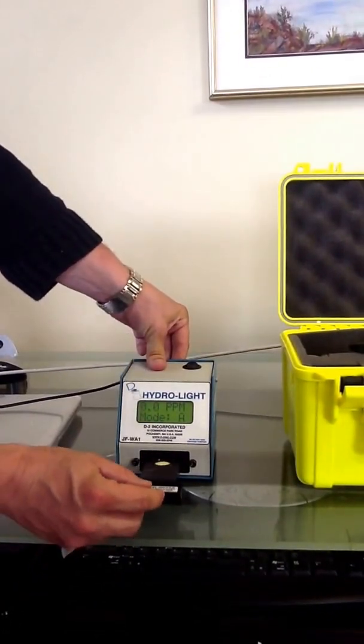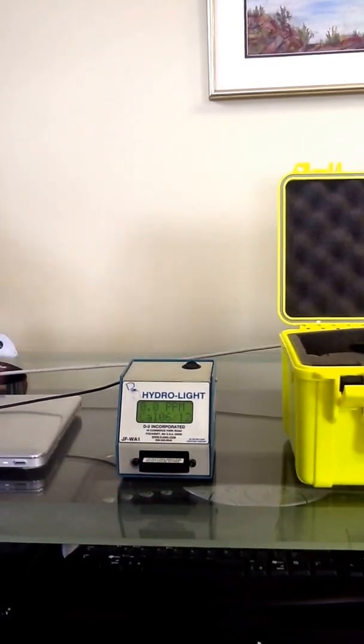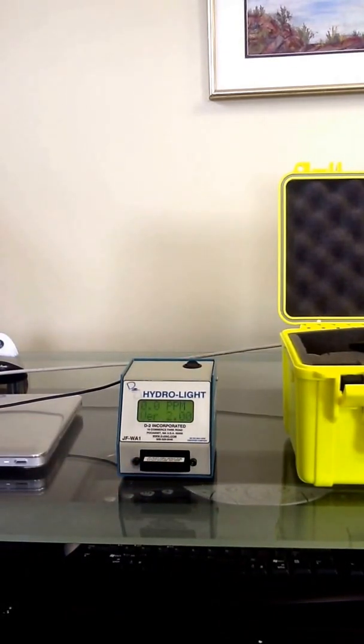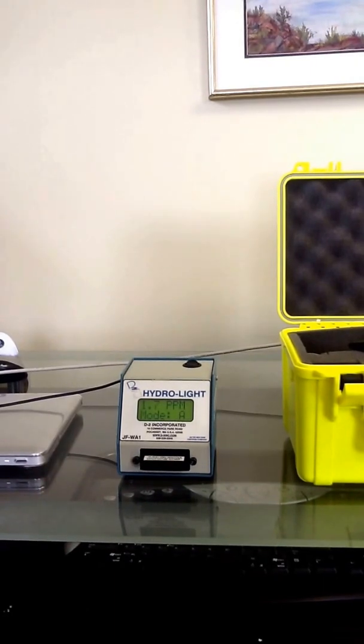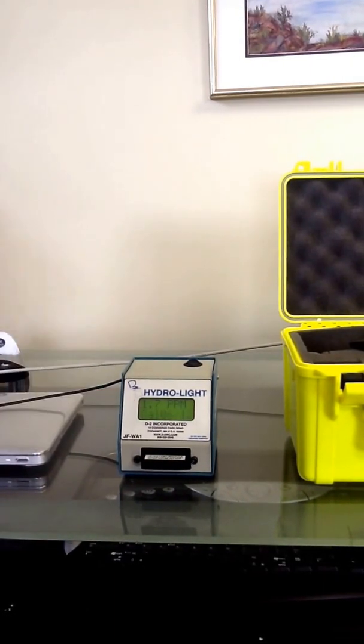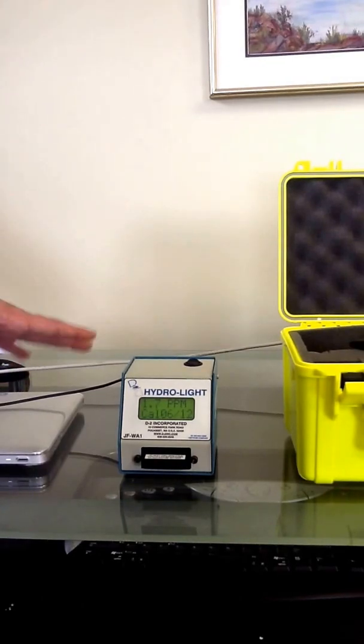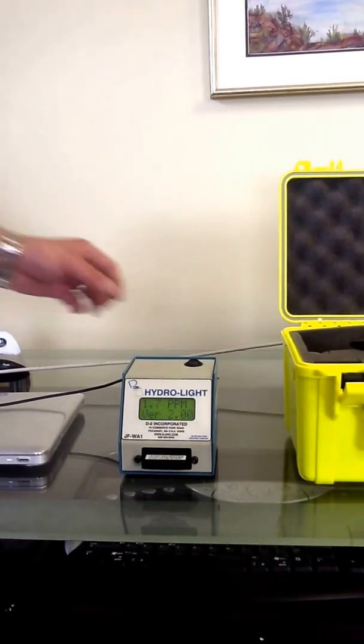So now we're going to test it by putting the low side in. So we should get 1.7, or at least within 0.3 of that. It takes about three seconds to take a measurement, and then you can see here, 1.7 parts per million. Every time the screen flashes, it's taking another measurement.